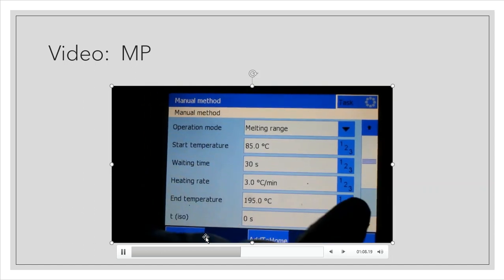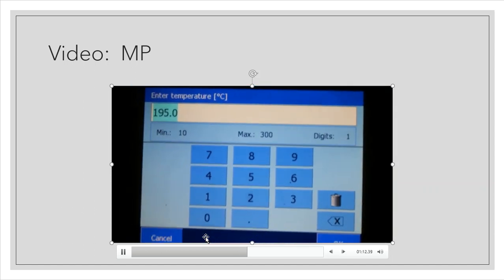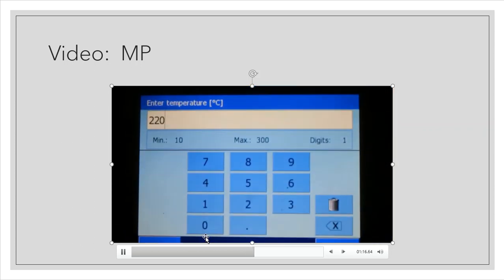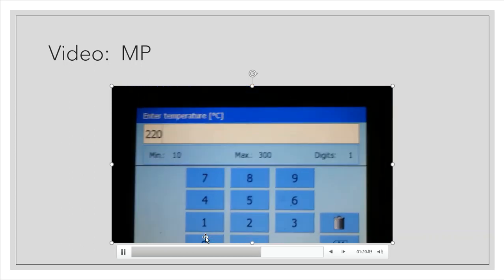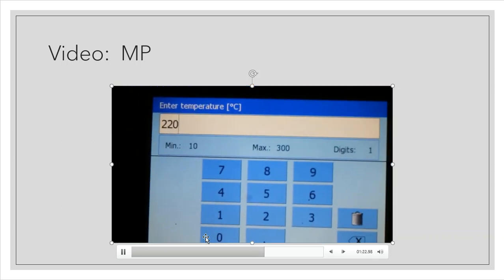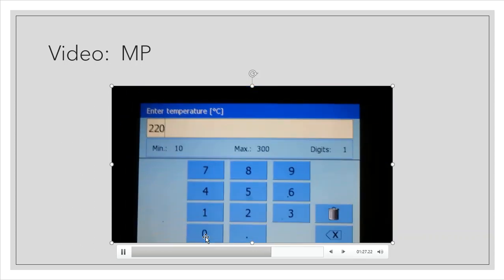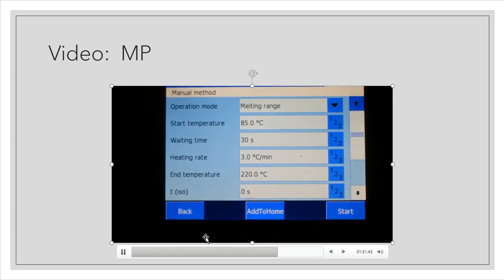The end temperature right now is at 195. However, I'm going to change this to about 220. And the reason is because my other product has about a 200 and some odd degrees Celsius melting point. So just in case it's that one, I need to go a little bit above. And then down at the bottom, I'll hit OK.